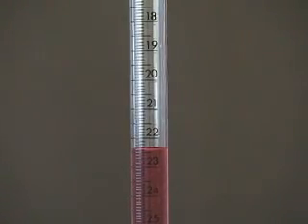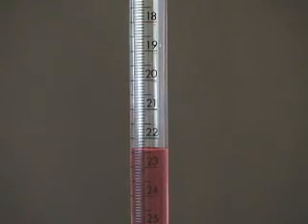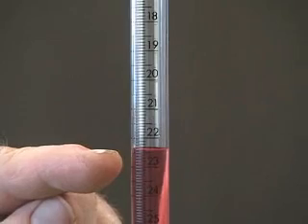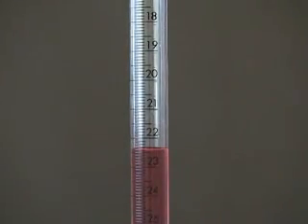Here's a real piece of chemistry glassware called a burette. It has a red liquid in it. We use these things a lot in general chemistry lab, and we want to learn how to read the volume of the liquid in the tube.